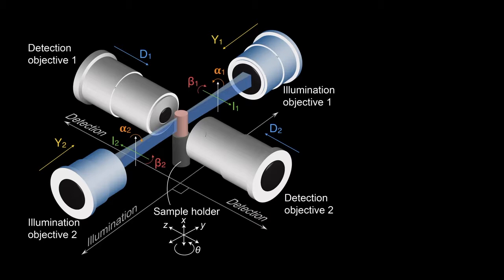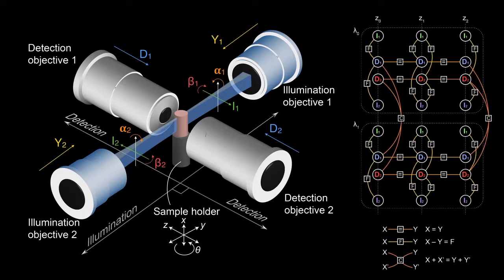And we have a theory, I will not go into the details, that tells us how to optimize all these different parameters for different depths and different colors and how they're related to one another, because of course you cannot turn these knobs independently, you have to understand their relationships. And we have also both hardware and software strategies to make measurements that tell us how to adjust these knobs and how to optimize the microscope every few minutes. So let's have a look at the microscope in action.